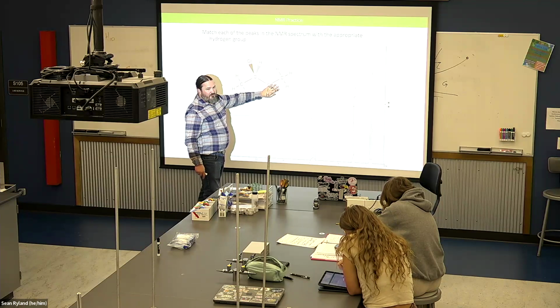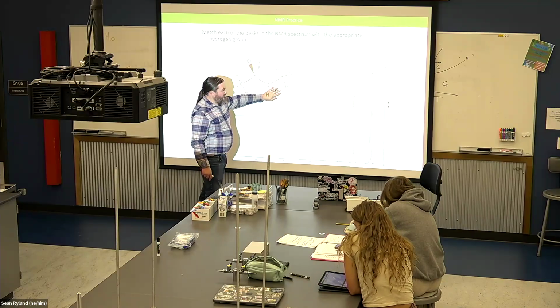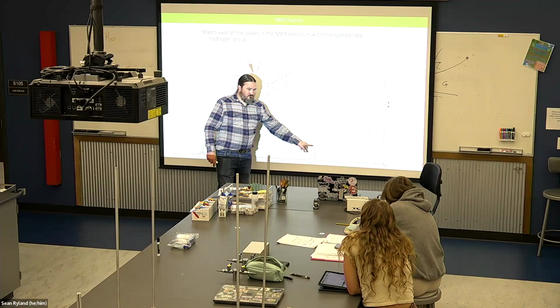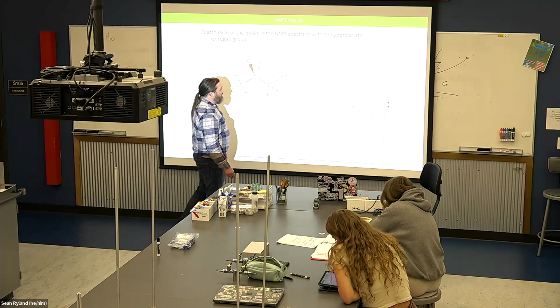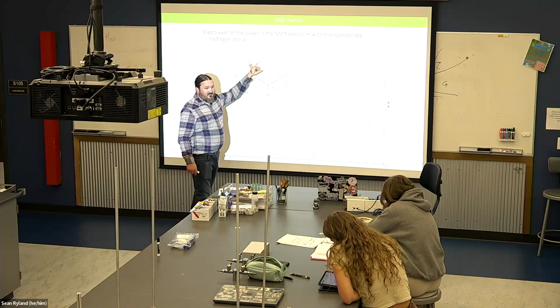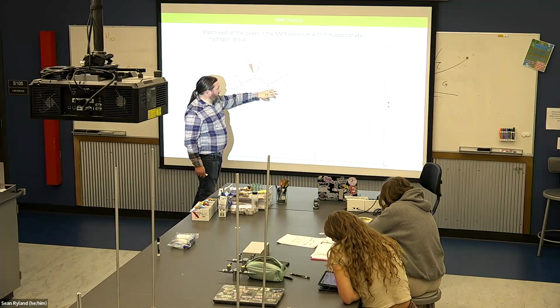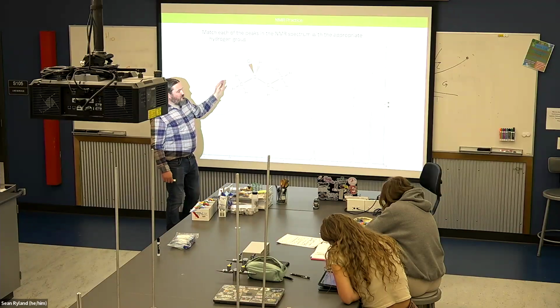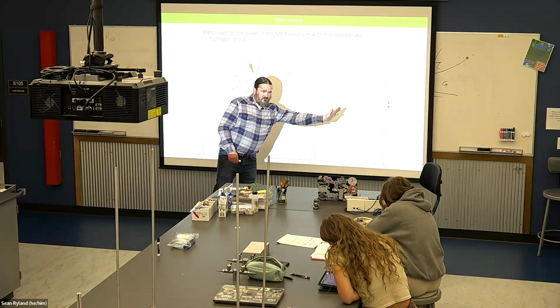So it should show up with 5 peaks, right? So we're going to be like the second one from the left. Yeah, which also makes sense because it's kind of close to chlorine. It's not as close, but it should be a little bit de-shielded. And in general, methyls, primary carbons, are going to be furthest to the right.